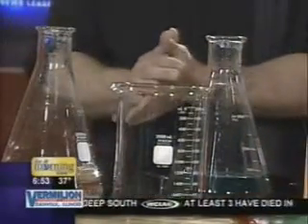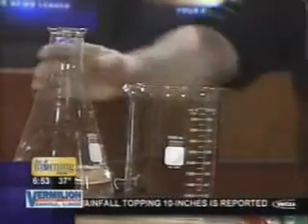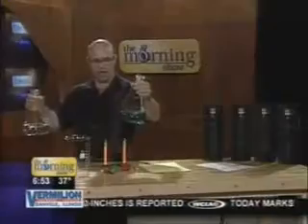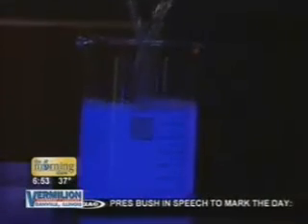But we want it to glow a little bit more spectacularly. Can we get the lights down in a second? All right. You're going to be able to pour, you okay? Yeah, I believe so. All right. So I have the luminol on the one side, and I've got hydrogen peroxide on the other as an activator. And when we mix them together... Whoa. It's kind of cool. Very nice. And there we go. This is the same process that lightning bugs use in bioluminescence.